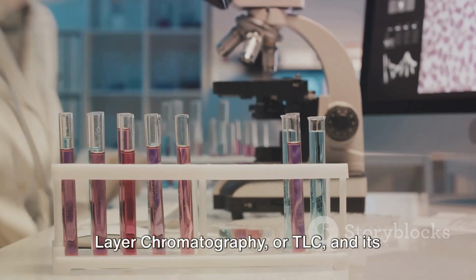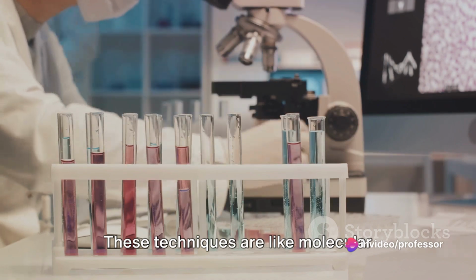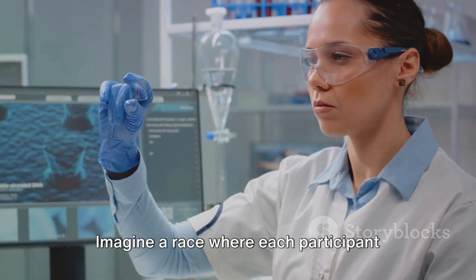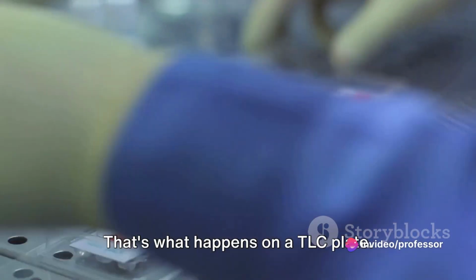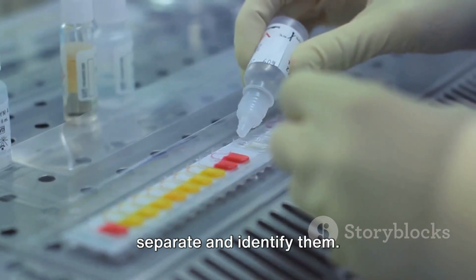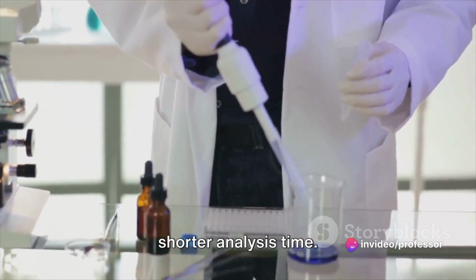First up, we've got thin layer chromatography, or TLC, and its high-performance sibling, HPTLC. These techniques are like molecular detectives, helping us track down and identify the components within a mixture. Imagine a race where each participant runs at a different speed based on their unique characteristics. That's what happens on a TLC plate. The different components in a mixture travel at different rates, allowing us to separate and identify them. HPTLC is simply a more refined version of TLC, providing better resolution and shorter analysis time.